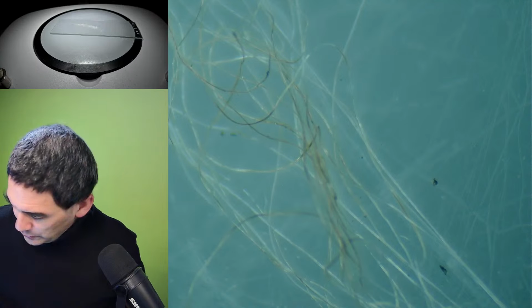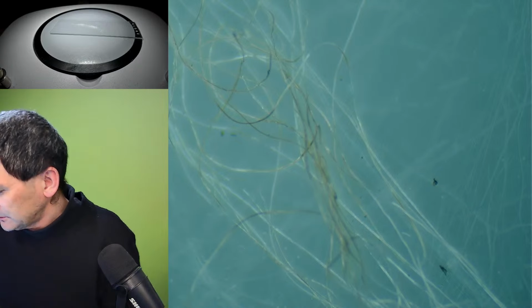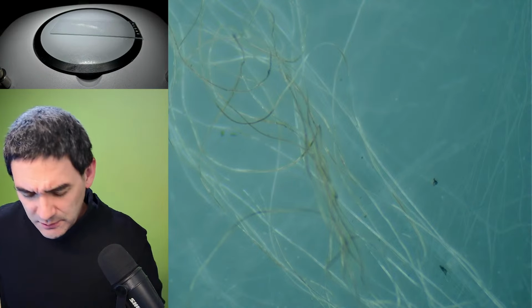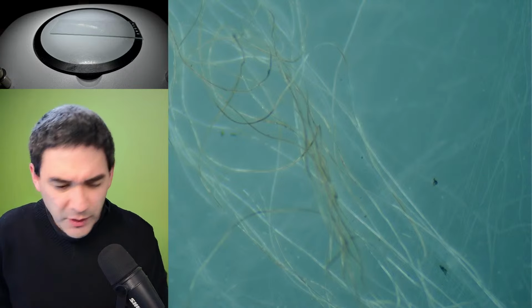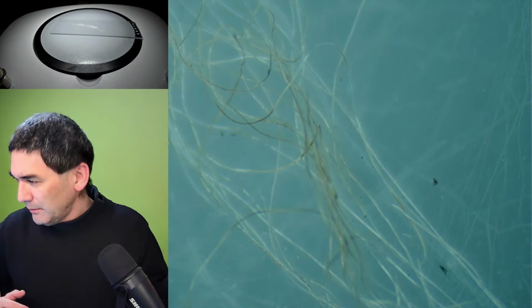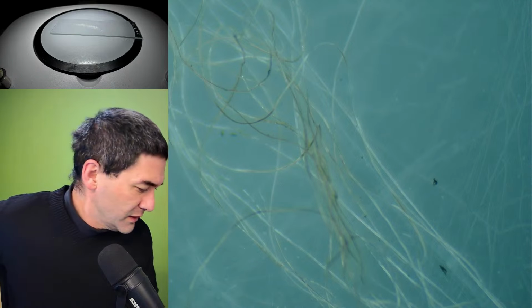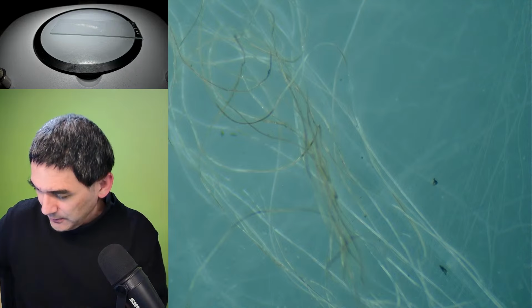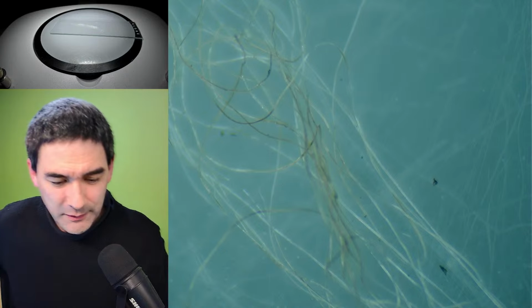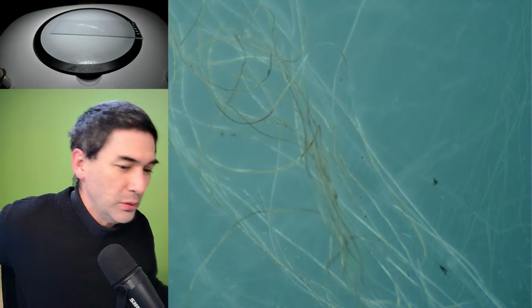You know what I'm going to try? I'm going to try to make the bottom side a little bit darker. Where did I put my polarizing filters? Can you believe this? I just had them and I just put them somewhere and I forgot where. I keep on losing things directly on my table. Isn't this cool?